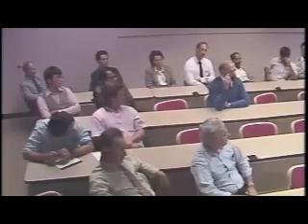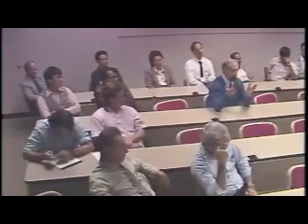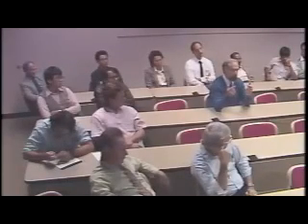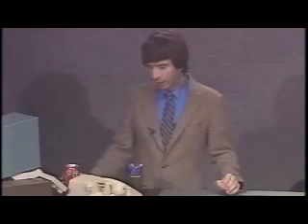Yes? You mentioned as an application the measurement of the grain boundary diffusivity of deuterium. Yep. I would argue that that's probably not the grain boundary diffusivity because you're measuring along the edge of the grain boundary intersecting the surface. Yes, right. The question, though, is that significantly different than the diffusivity of the deuterium just on a surface without being on the grain boundary? No, we really don't think it is. Now, precise measurements of that particular parameter haven't been made.